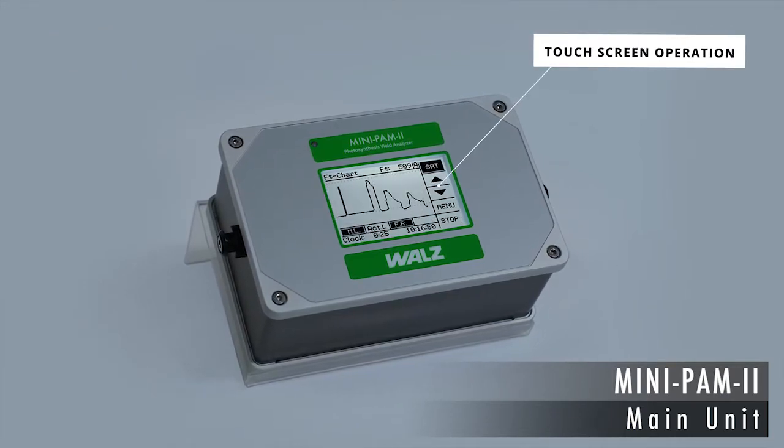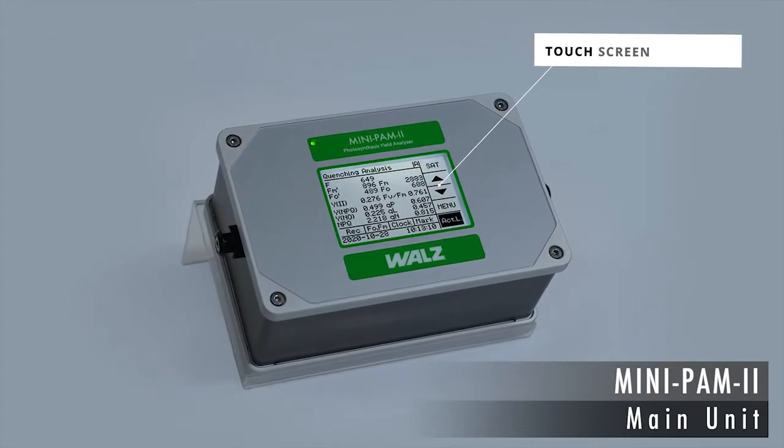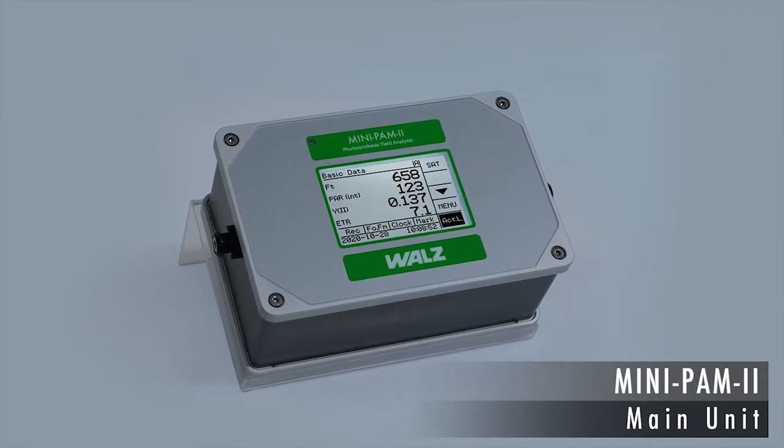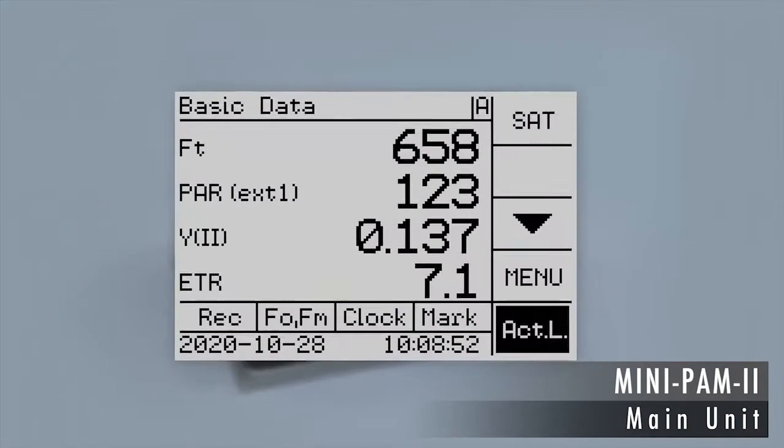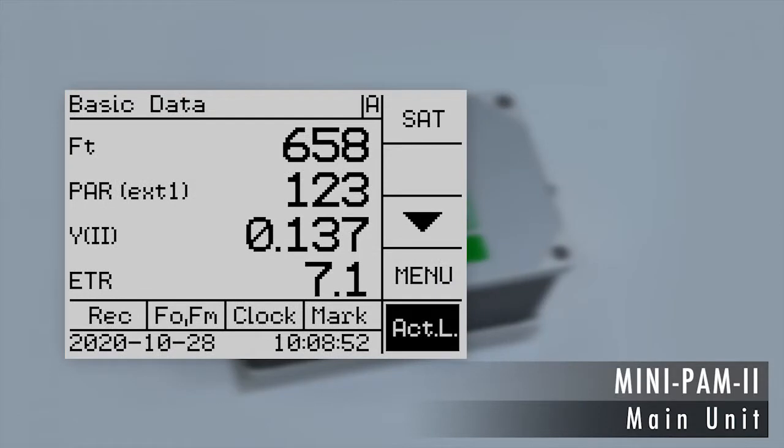Easy-to-use navigation keys provide quick access to the various functions of the device. You have the option of displaying only the key parameters: the fluorescence level, the photosynthetically active radiation abbreviated PAR, the efficiency of Photosystem II and the electron transport rate.